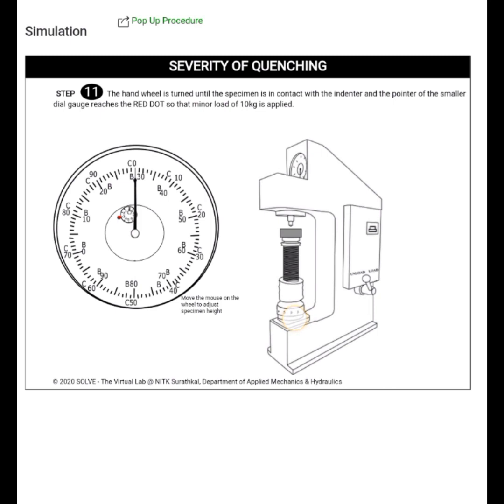So we need to move the wheel to adjust the specimen height. Tighten the specimen. Just wait for a second. Okay, it's complete.